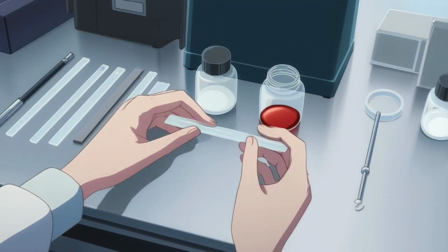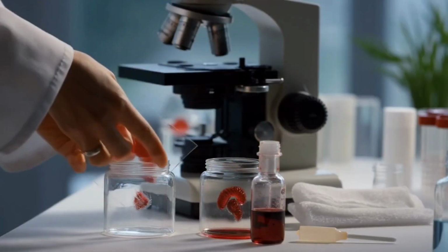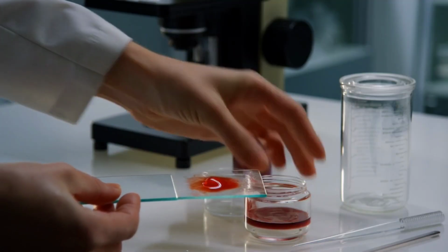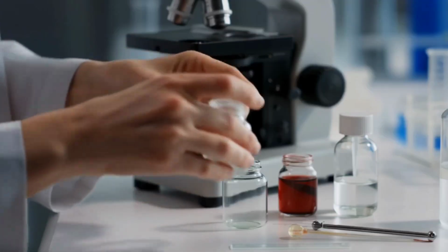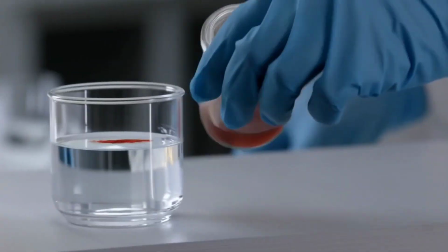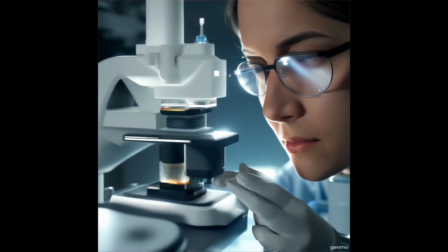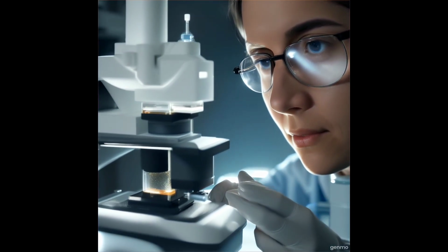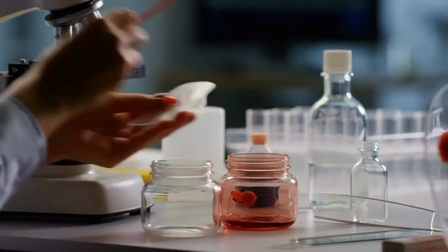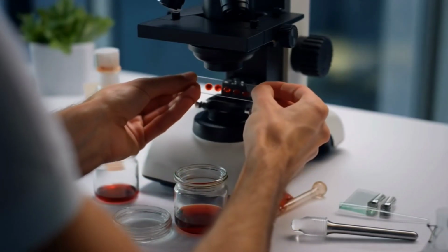And it has shown the exact staining, it has shown the microscopic analysis, and in humanized form it is showing the fixing with alcohol and ether for the saliva and the acetocarmine staining and the microscopic experiment, but it is not showing the result of what we got. So this is what the AI generated for me, and I could have gotten more, but there's no confirmation to it. So now we will be moving on to the rest of the video which I made in the chart representation, and after this video there will be more AI videos generated.